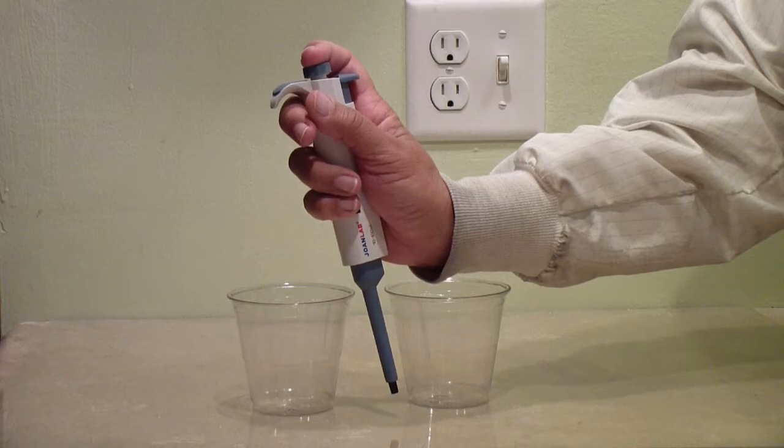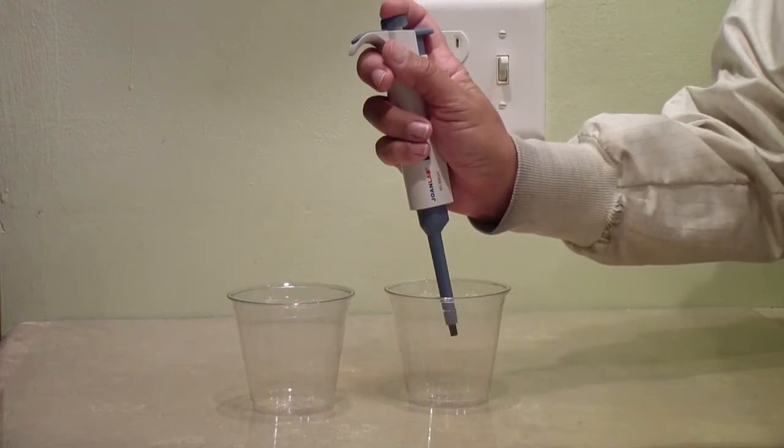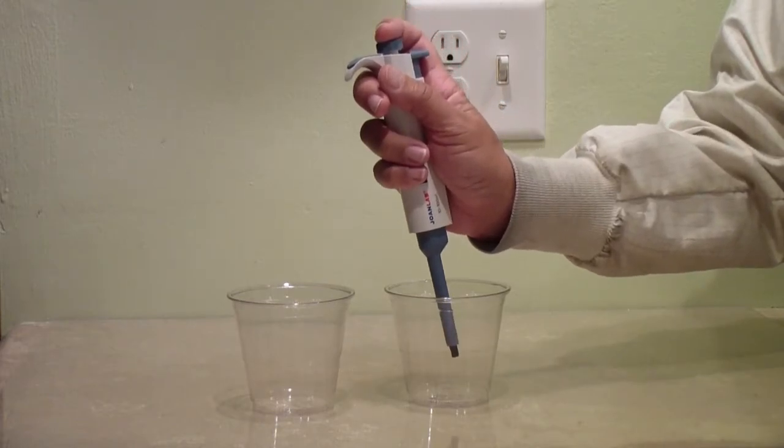Stick the imaginary tip into your imaginary liquid. You only put the tippy end of the tip in the liquid. If you put the tip in too deep, you risk getting water near the top of the tip, which can damage the pipette.